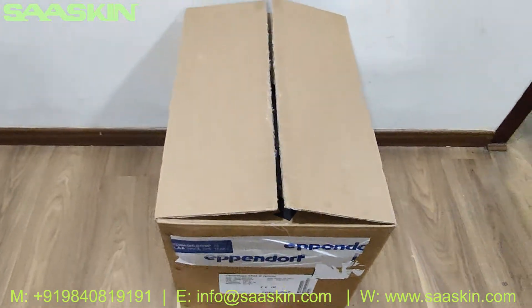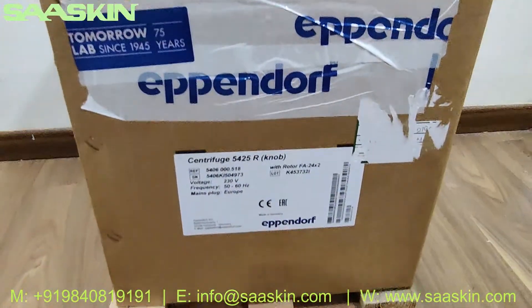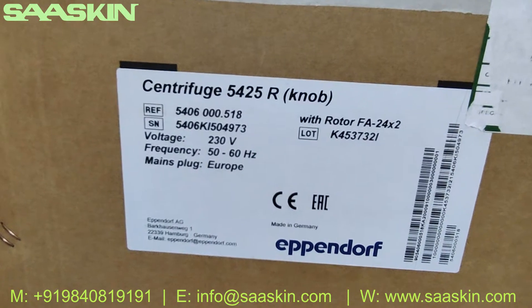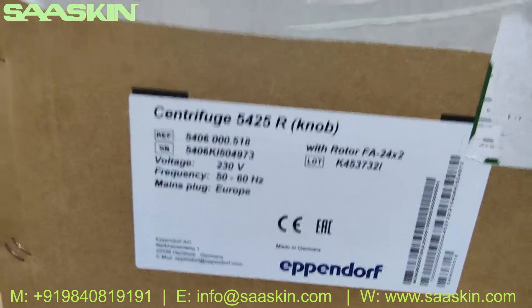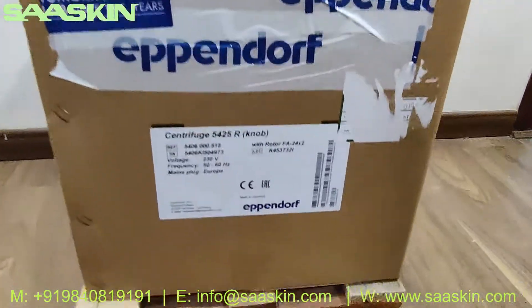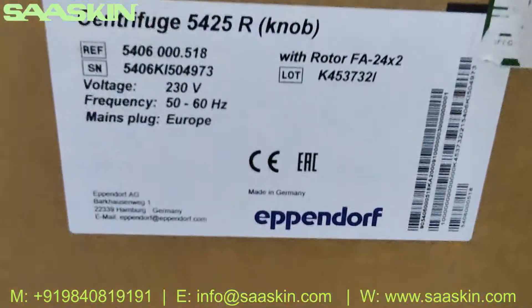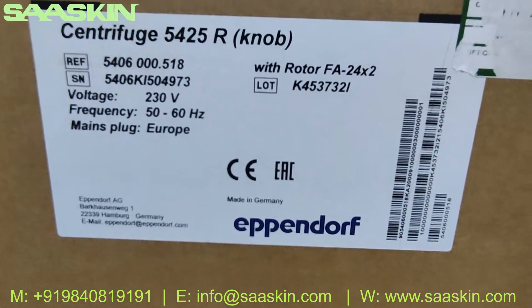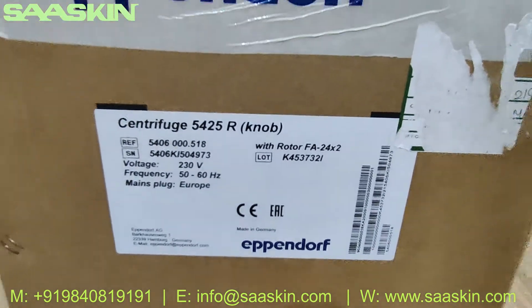Hello everybody, today we're going to see the unboxing of the Eppendorf centrifuge 5425R model with rotor. This is the model we're going to see today. We're going to see the condition in which the product has been received. Just to reiterate, it's an Eppendorf brand centrifuge 5425R model — a completely CE-certified product with the rotor setup.